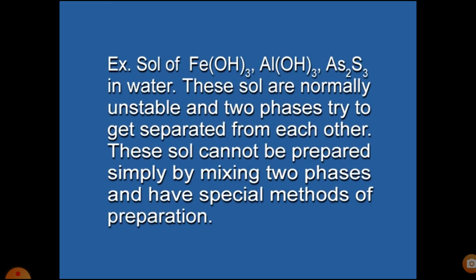This sol cannot be prepared by simply mixing two phases and has special methods of preparation. Here, for the preparation of lyophobic sol, we will do dialysis. We will learn later.